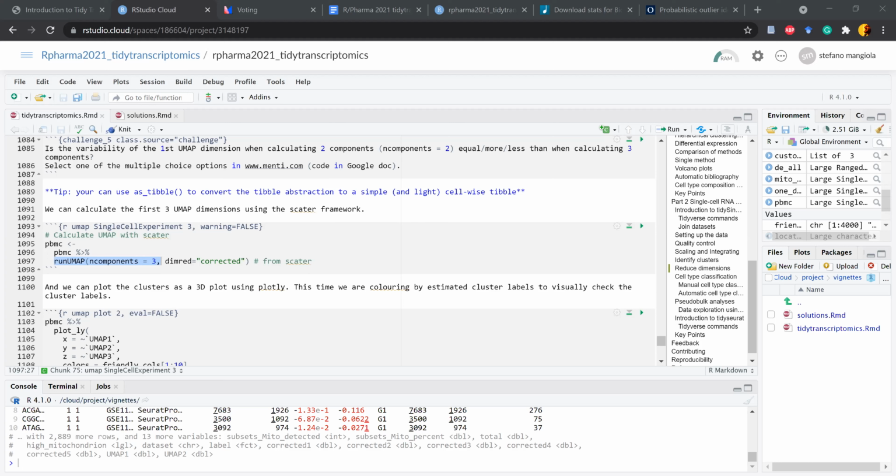So we are simply creating an interface for single cell experiment for you. There is nothing different from that. And this is also true for summarized experiment. We are creating just an interface that you can interact with, but underneath there is the same object as you would expect. That's why you can use your workflow as before with no difference. That's why the efficiency remains the same, because the object remains the same. That's the actual reason.